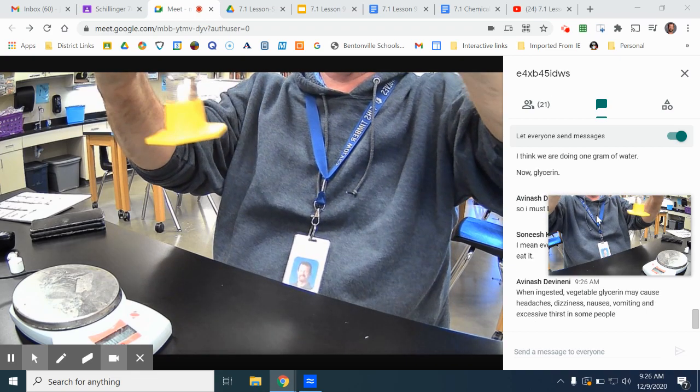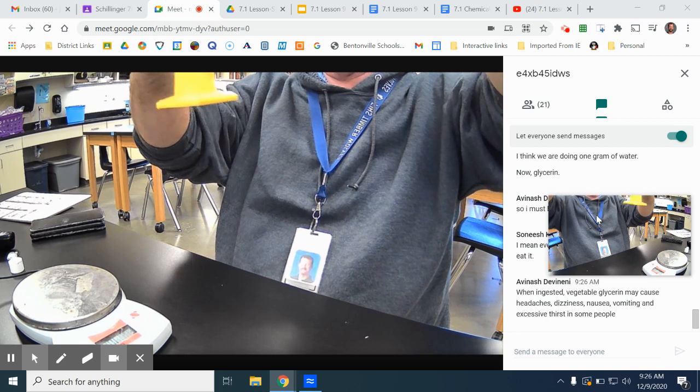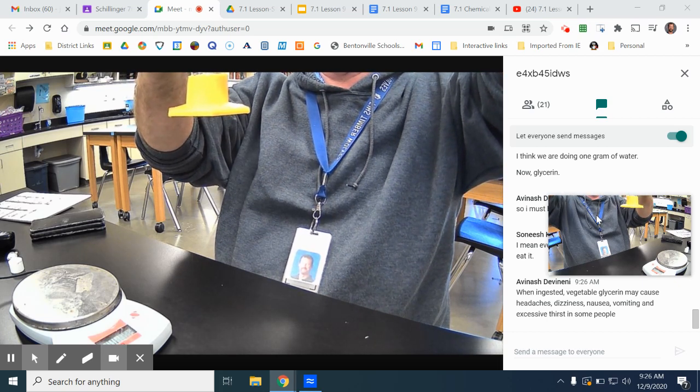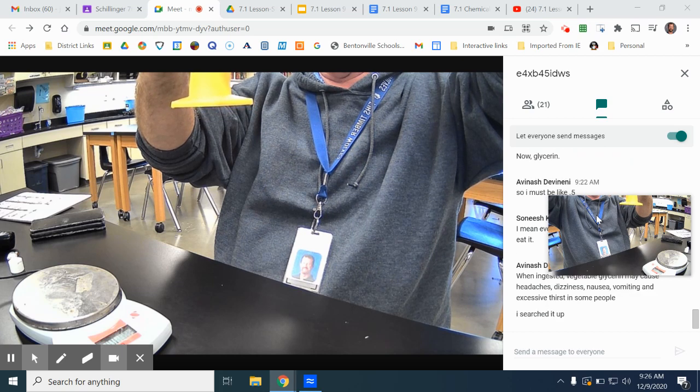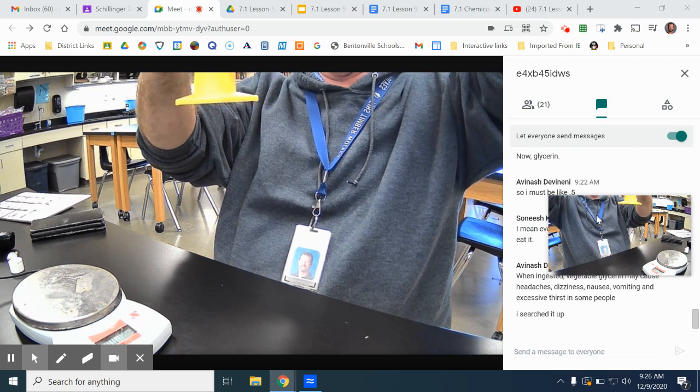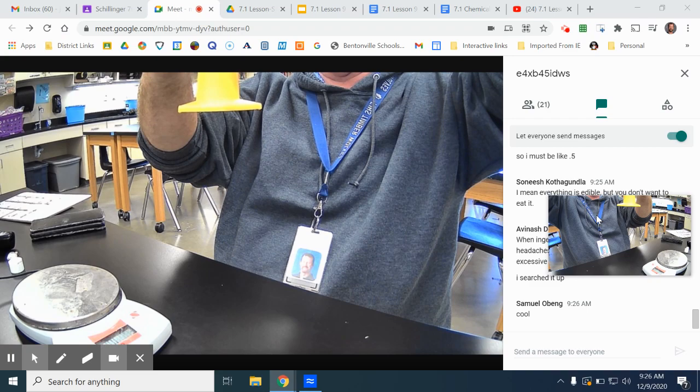Oops. Not quite there. This is really thick, so I got to go slow, make sure I don't go over.